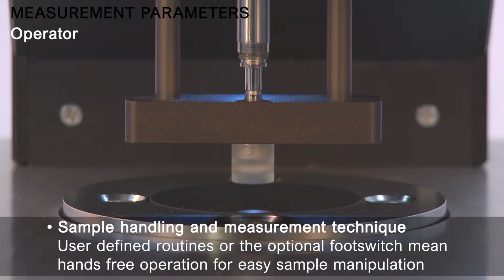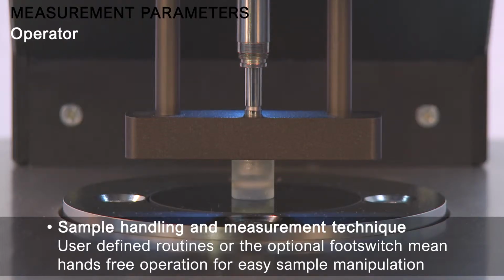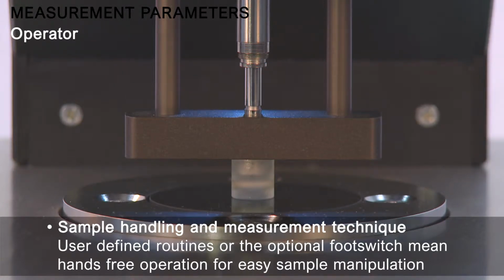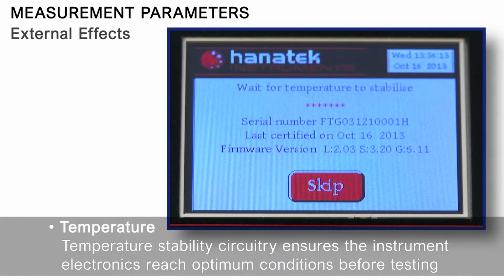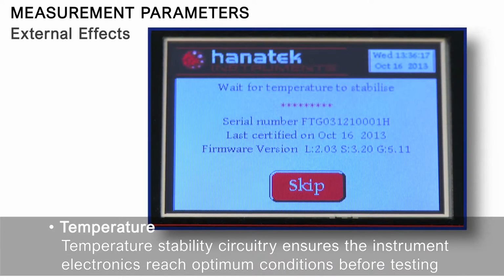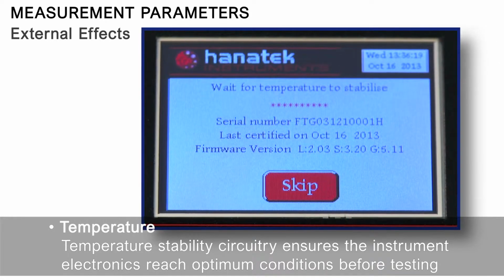Operator: sample handling and measurement technique. User-defined routines or the optional foot switch provide hands-free operation for easy sample manipulation. External effects. Temperature. Temperature stability circuitry ensures the instrument electronics reach optimum conditions before testing.